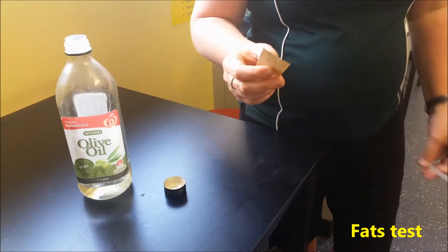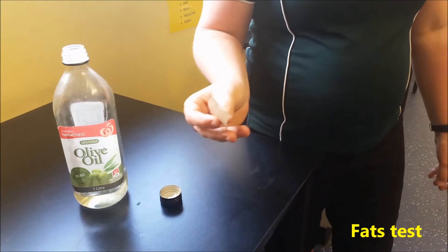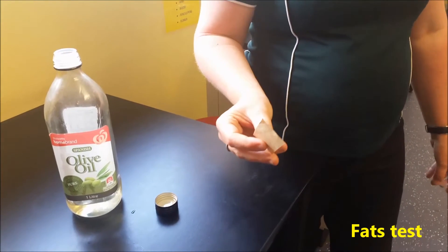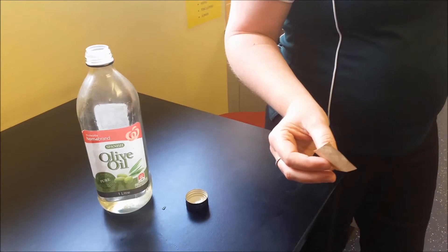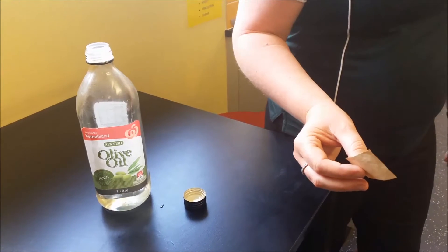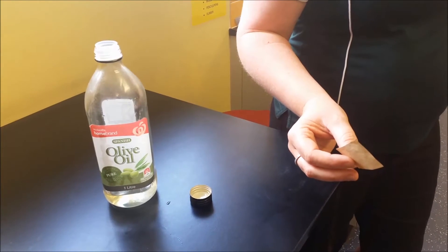Do the test for fats, or another thing they might call it is fats and oils, or another word for fats is lipids. They are also a type of nutrient that is found in a lot of different foods.